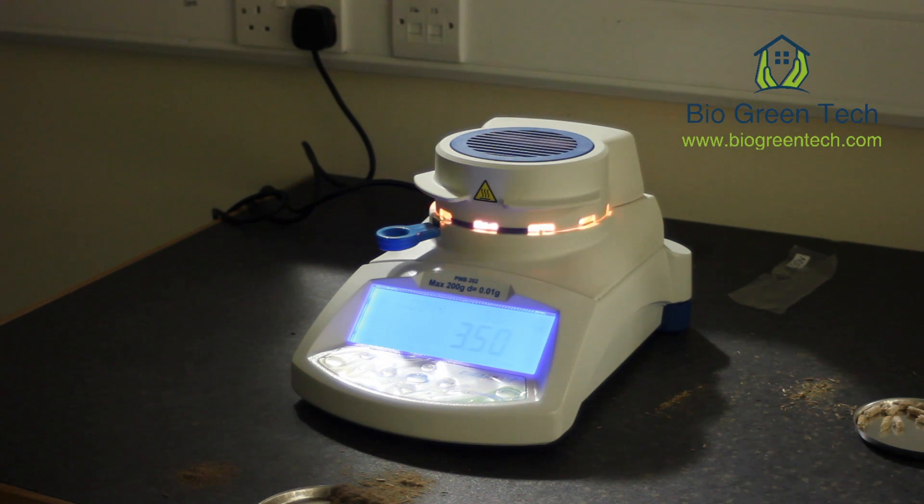And then we can do a moisture analysis of the pellets once they've been cooled from the pellet machine.